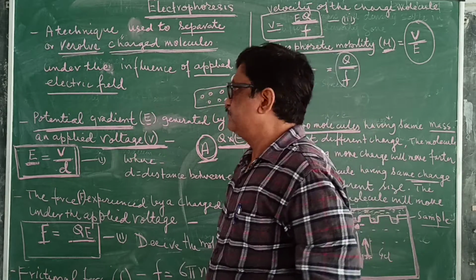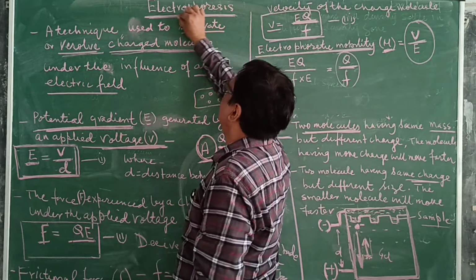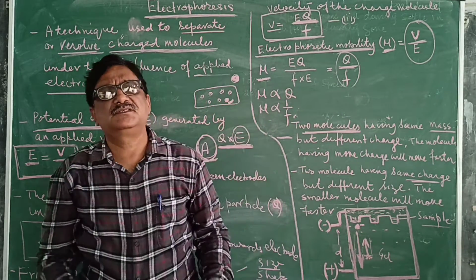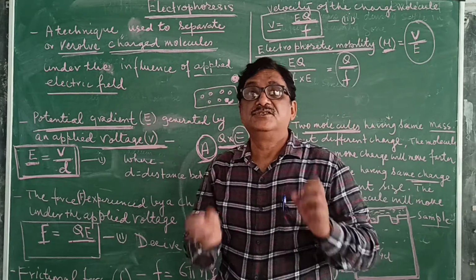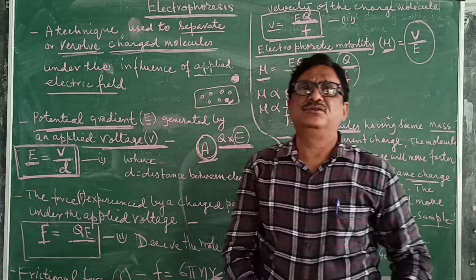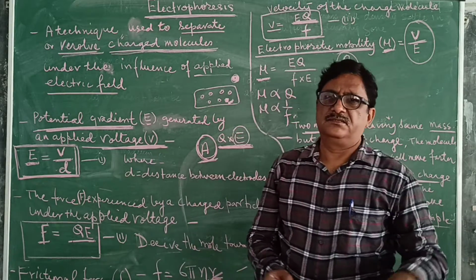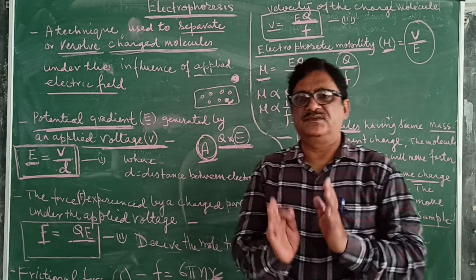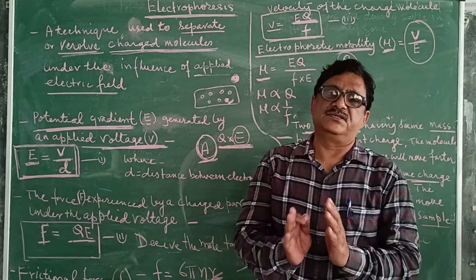I am FATMI. Today we will discuss electrophoresis. What is electrophoresis? Electrophoresis is a technique of separating or resolving charged molecules like protein or nucleic acid, RNA or DNA, etc. So these molecules which have some charge can be separated using a technique called electrophoresis.